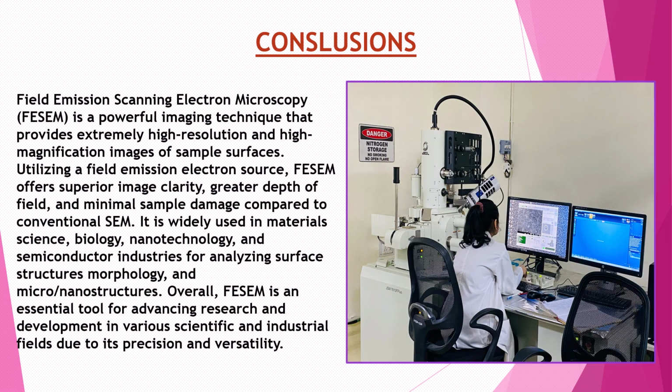And lastly, in conclusion, FESEM is a powerful imaging technique that provides extremely high resolution and high magnification images of sample surface. Utilizing a field emission electron source, FESEM offers superior image clarity, great depth of field, and minimal sample damage compared to conventional SEM. It is widely used in material science, biological, nanotechnology, and semiconductor industries also.